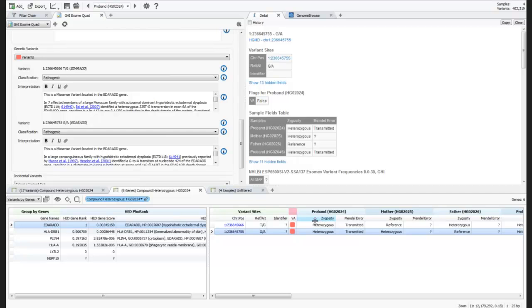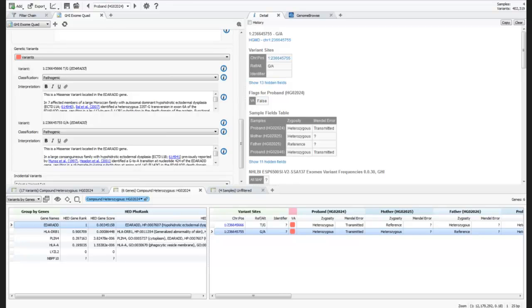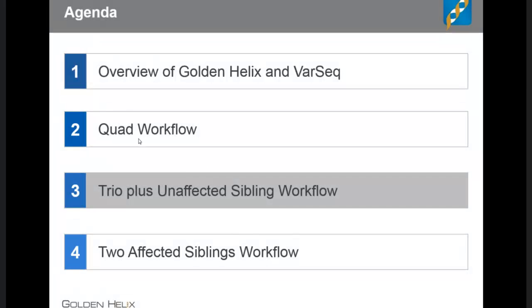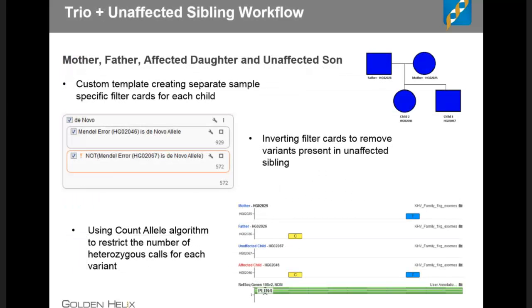So our quad workflow is complete. Let's move on to our trio plus unaffected sibling workflow. For this workflow we have a mother, father, one affected daughter, and an unaffected son. We'll use the custom template to set sample-specific filters to exclude information present in the unaffected son — specifically looking at how inverting filter cards works — and we'll also use the count allele algorithm.